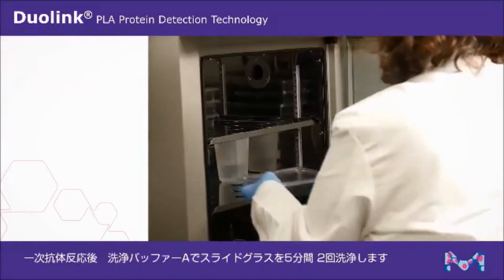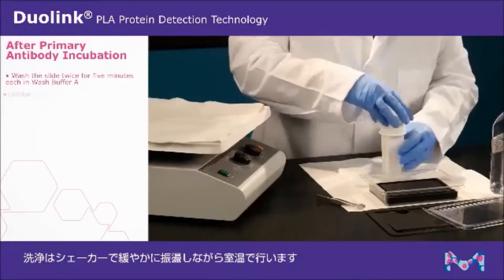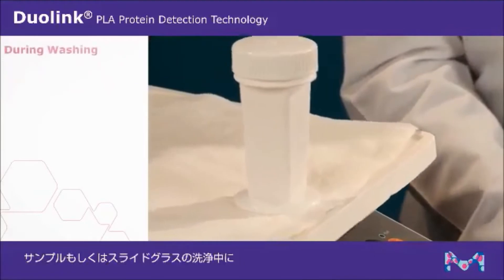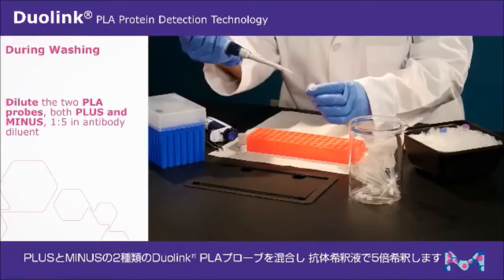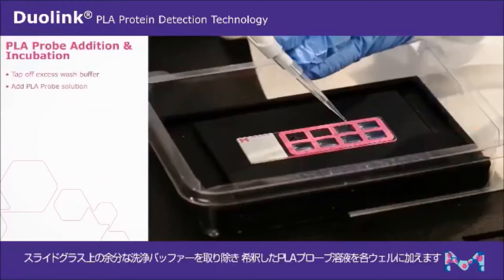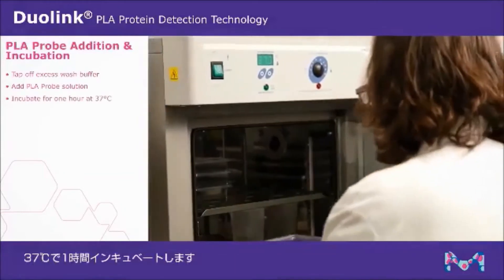After incubation, wash the slide twice for five minutes each in wash buffer A with gentle orbital shaking at room temperature. During washing, dilute the two Duolink PLA probes together, one to five, in antibody diluent. Tap off excess wash buffer and add the PLA probe solution to each well. Incubate for one hour at 37 degrees Celsius.